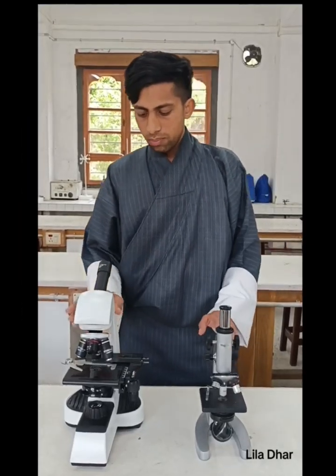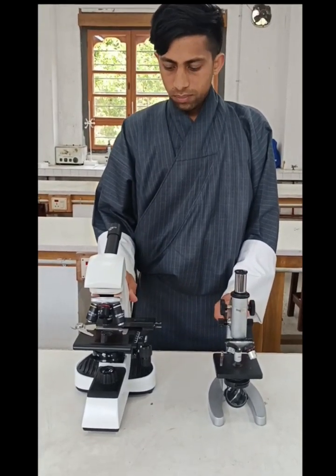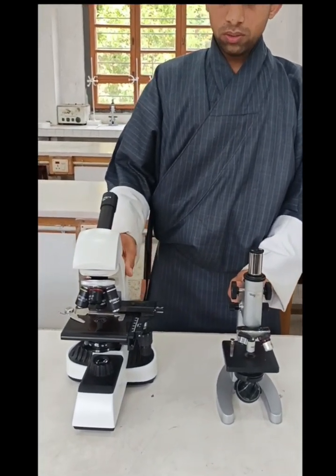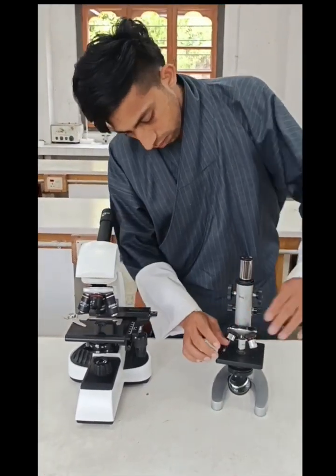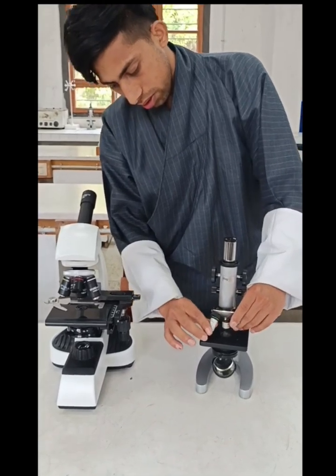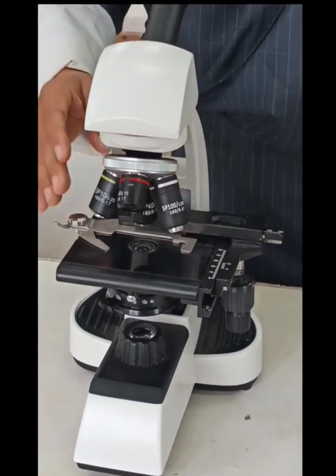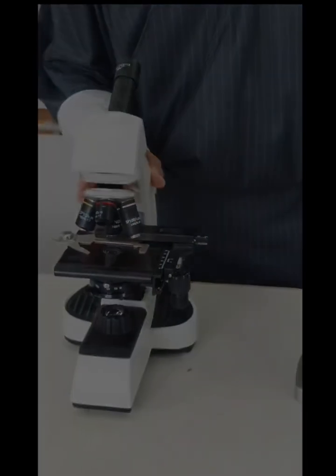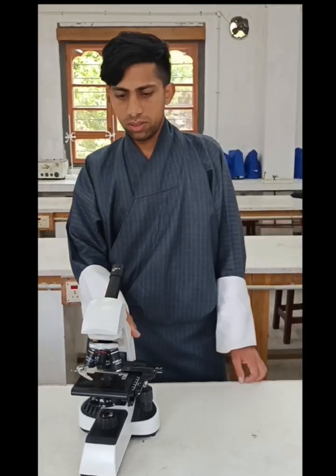So talking about the compound microscope, these are the two types of compound microscope. But comparing this to this, we prefer this over this because this has only 40x magnification whereas this has 100x magnification. So we prefer this over this. Now I will be talking about the parts of this compound microscope.